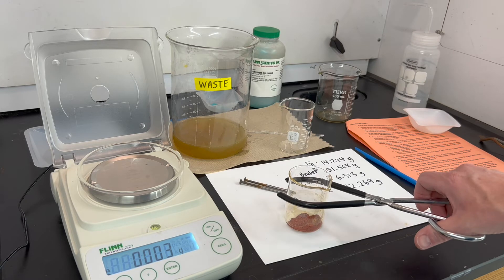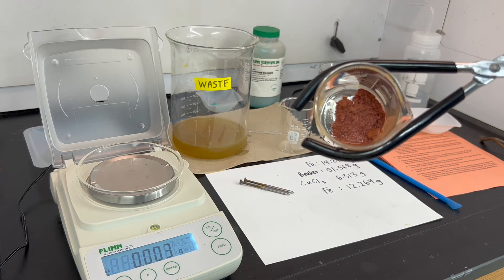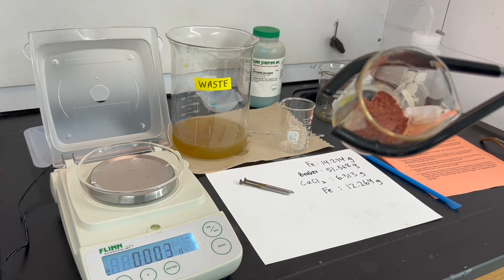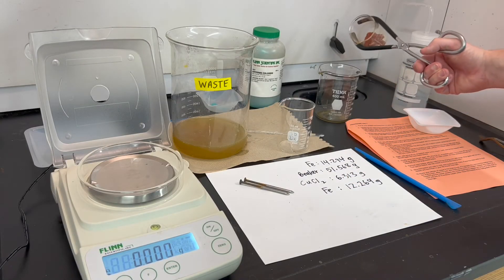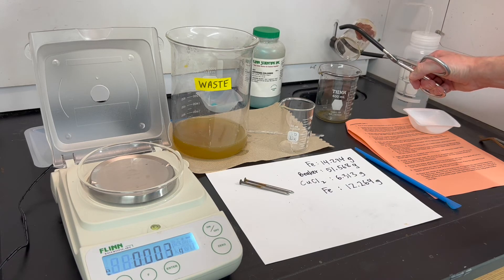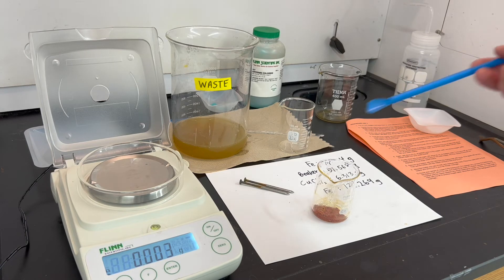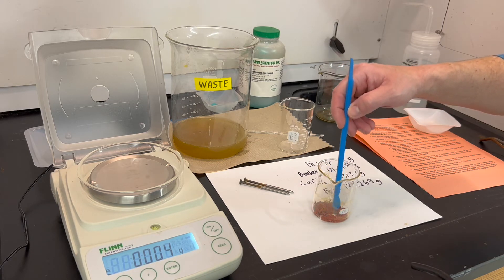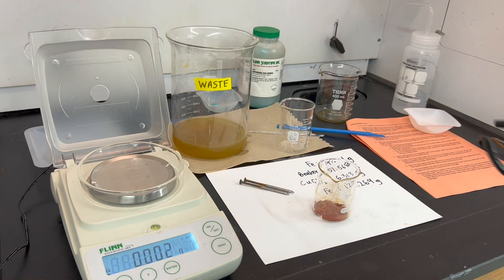I pulled out my beaker of copper from the drying oven and I can see there's still some water clinging to it. I'll decant that little bit of water and use a plastic scoop to spread out the copper pieces so the remaining water can evaporate more easily and they're more exposed to the heat of the oven. Then it goes back into the drying oven to continue drying.